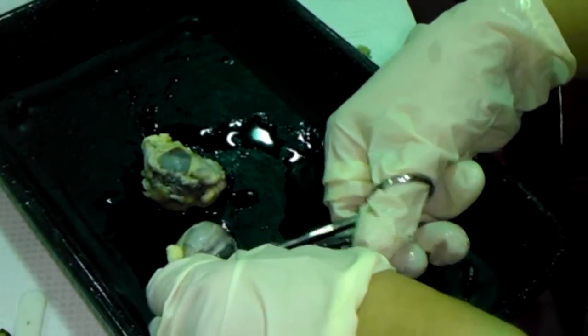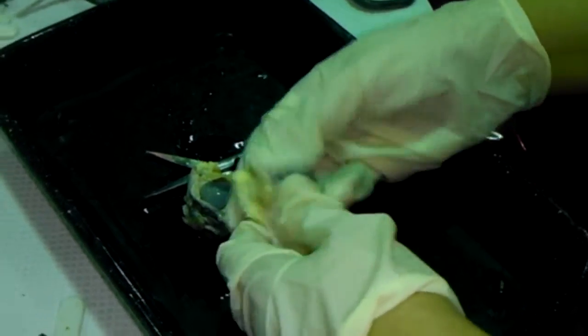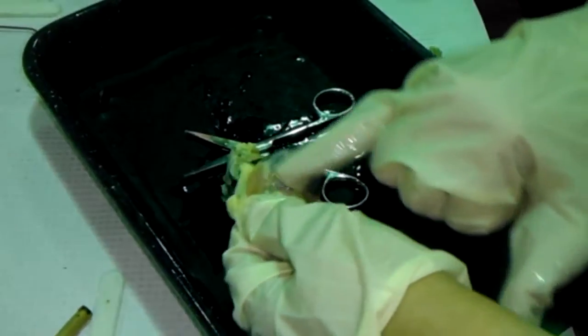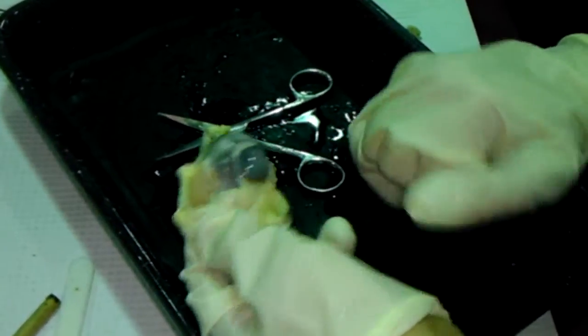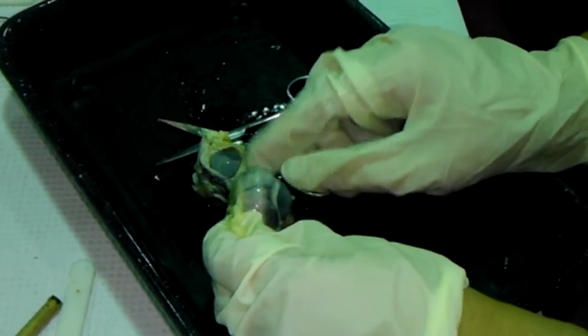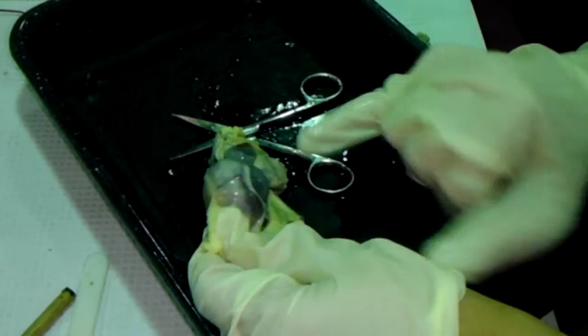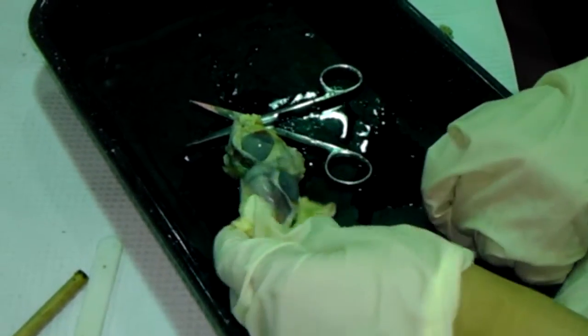Everybody's fine so far? Please sit down. You can see the sclera and cornea both. So this is the cornea. Whatever you have around it is the sclera, right? These two make the outermost layer of the eyeball, which is which layer, Sarah? Fibrous tunic, right? So this is the fibrous tunic. It consists of the sclera and cornea.